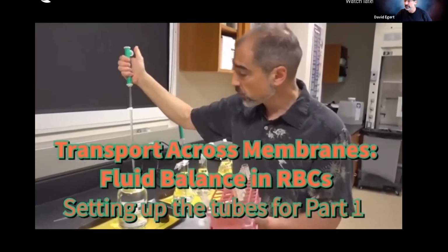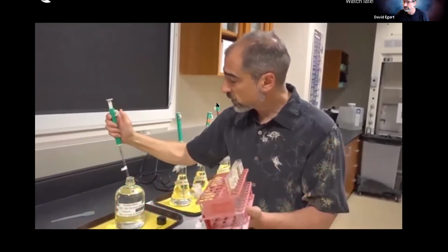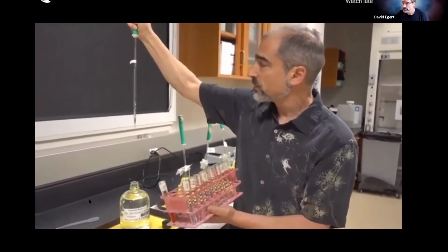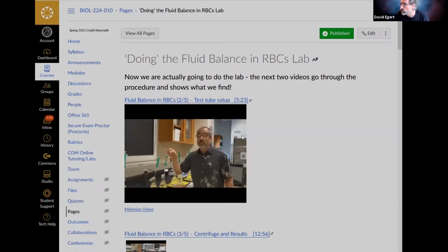So I'm going to start with 3 mils of distilled water in test tube 1. Again, we've already discussed the proper use of these pipettes. I've sucked up to the 0. Wait. Okay. Different version of tube 9 with the glycerol.